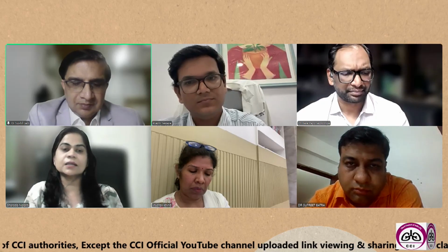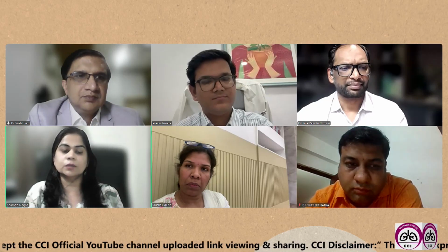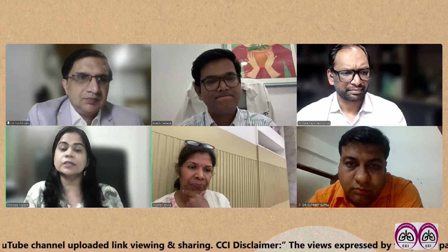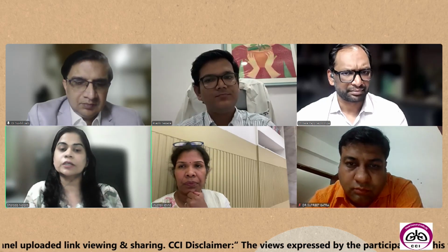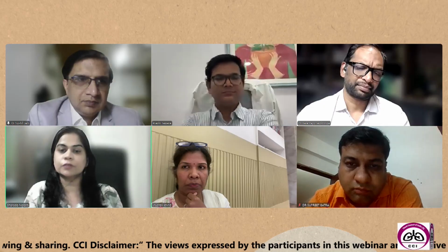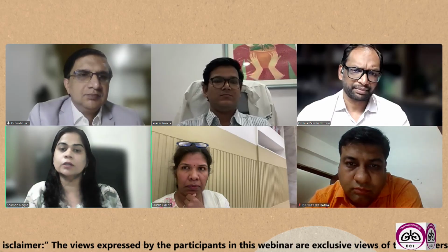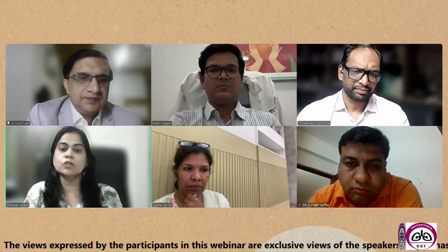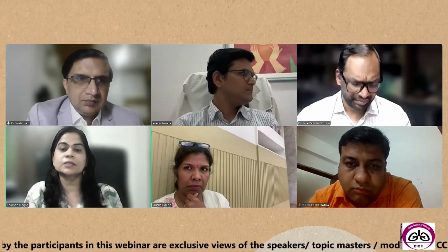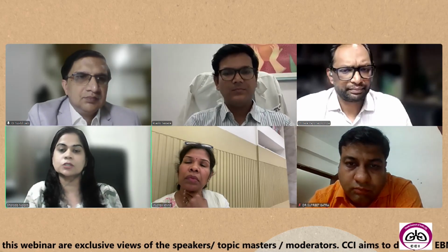And next, coming to the fixative. A proper fixative has to be used for cell block preparation. The most commonly used are normal saline and formalin. Whether it is normal saline or formalin depends upon the clotting agent that your lab is using to make the cell block. Different labs use different clotting agents, so depending on that, you can use either normal saline or formalin. But the most widely used is 10% neutral buffered formalin, because normal saline causes disintegration of the cells rapidly. So I prefer 10% neutral buffered formalin as the fixative.